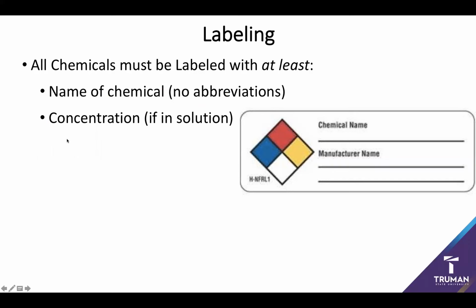And there have been numerous cases where somebody thought a beaker of clear colorless liquid was water and something disastrous happens. I encourage you to talk with some of your professors. They'll probably have at least one incident from the clear colorless liquid camp. So again, one of the things I want to emphasize is always label all of your solutions, even if you think it isn't a big deal, because it turns out occasionally it will be. And I've seen more than my fair share of chemical mix-ups in, again, the rush of working around a chem lab.